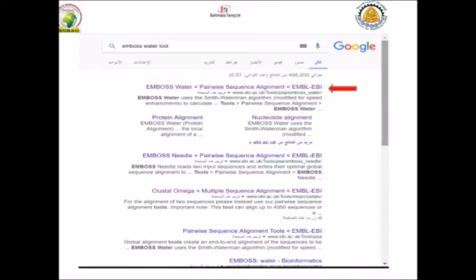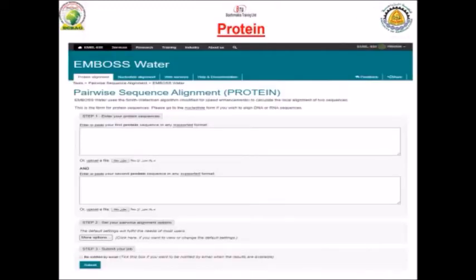EMBOSS Water is one of the tools available in the EMBL-EBI API. The tool gives you a very easy interface with two submission boxes. You can put your sequence — sequence number one — either by copy and paste into box number one, and sequence number two into box number two.